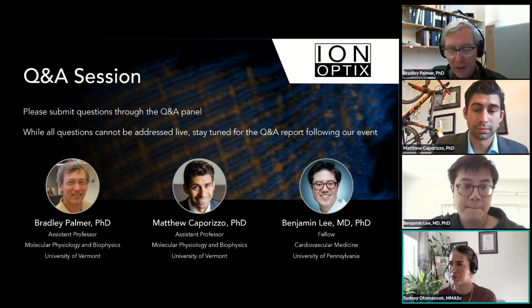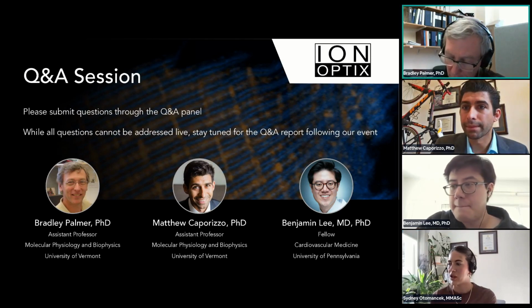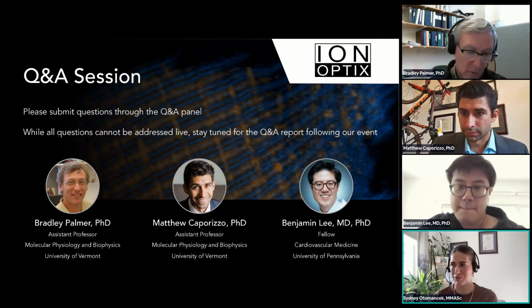I'm sorry, could you please say that one more time, Sydney? Sure. What is the significance of measuring diastolic sarcomere length?